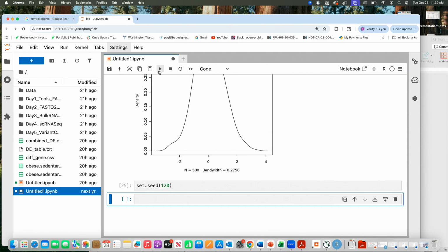Something that I forget often. Yeah, and especially this is very important for single cell analysis. You have to be really doing it because TSNE plots and UMAP plots are very sensitive, and they will change each time. And then PIs will ask, why last time I had something looking like this, now it is looking like that? So why is it so?